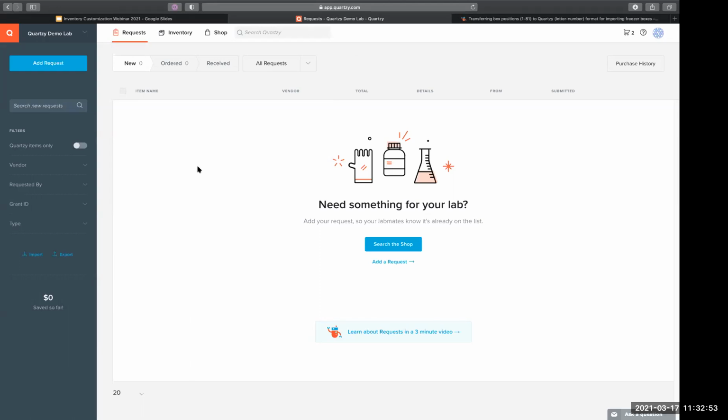Hey, I can talk actually. I thought I was locked out. So currently then manually we have to go in and, at the end of the day or something like that, just change the quantities ourselves. Because we're trying to figure out if the scientists can do it as they take stuff off the shelf, or does the lab manager do it once a week or once a day and manually go into Quartzy and go from 10 to 6. And then it definitely ties into the other question that people have been asking about a reorder quantity. So it comes up a lot in the Happy Labs network, and it's very helpful if someday that happened.